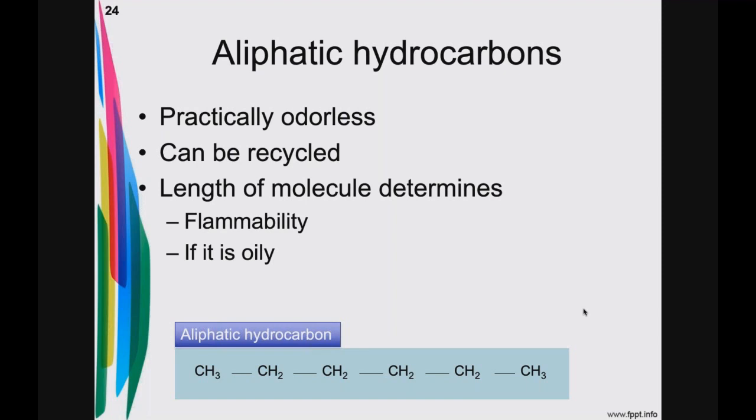But I would say probably the most popular xylene substitutes on the market right now are the aliphatic hydrocarbons. These guys are practically odorless. You are going to have to practically put your nose right on top of the fluid level to smell it. All right, it can be easily recycled.